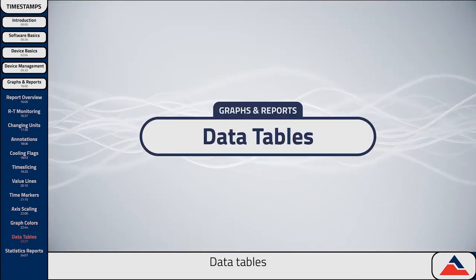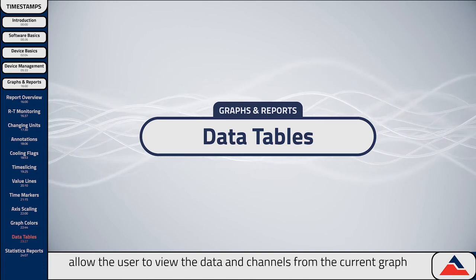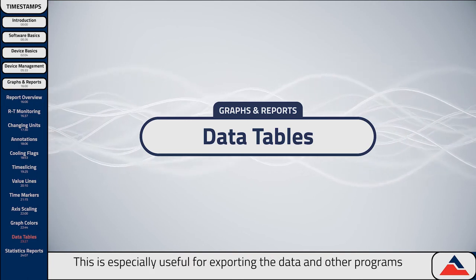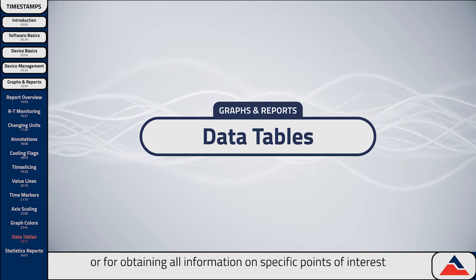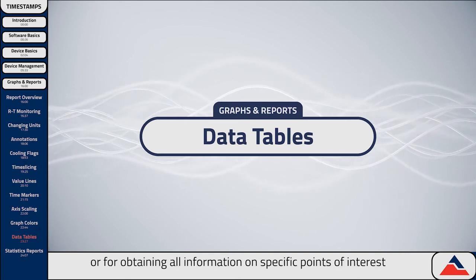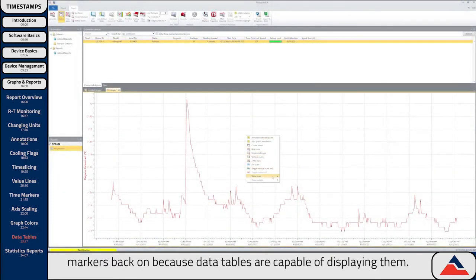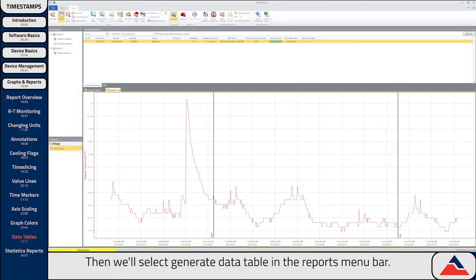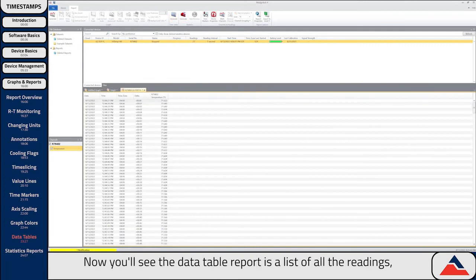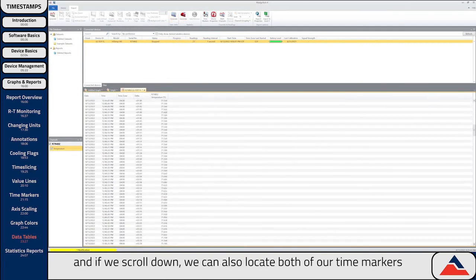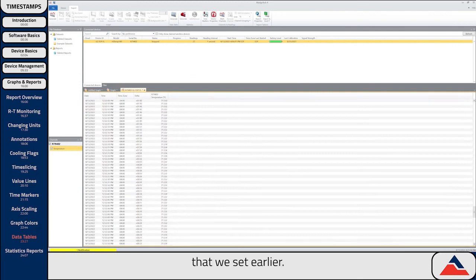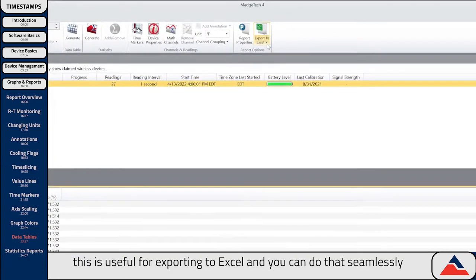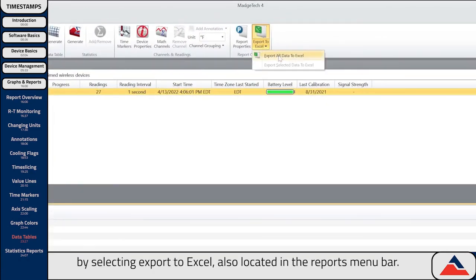Next we'll talk about data tables. Data tables allow the user to view the data and channels from the current graph as a consecutive list of data points. This is especially useful for exporting the data into other programs like Excel, or for obtaining all information on specific points of interest after your study. We're going to turn our time markers back on because data tables are capable of displaying them. Then we'll select Generate Data Table in the Reports menu bar. The data table report is a list of all the readings, and if we scroll down we can also locate both of our time markers. You can export to Excel seamlessly by selecting Export to Excel, also located in the Reports menu bar.